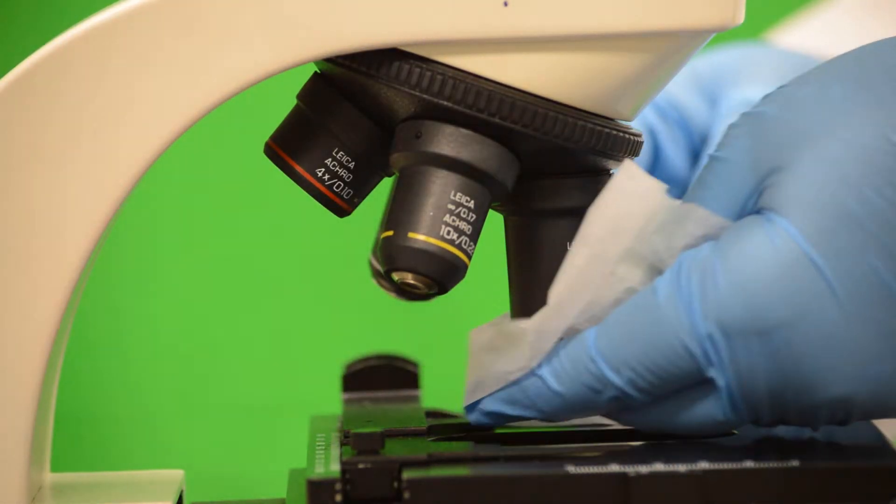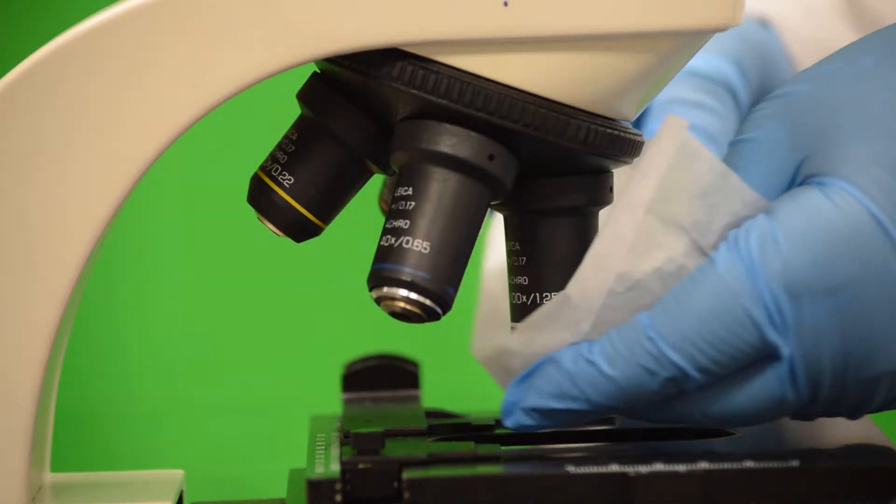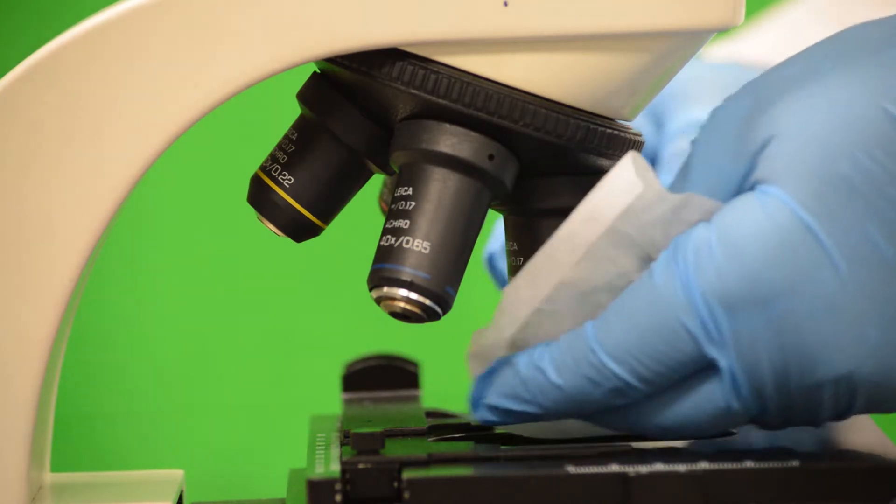Take a second sheet of lens paper, crumble it, and use it to wipe the lens dry to remove any moisture.